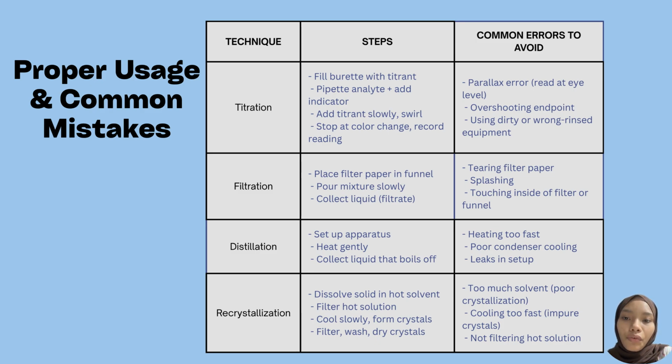Common errors that we need to avoid are using too much solvent, which will form a poor crystallization. Next, cooling it too fast will form impure crystals. And lastly, not filtering the hot solution.